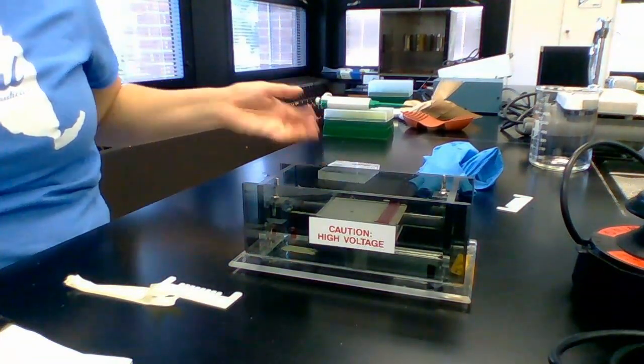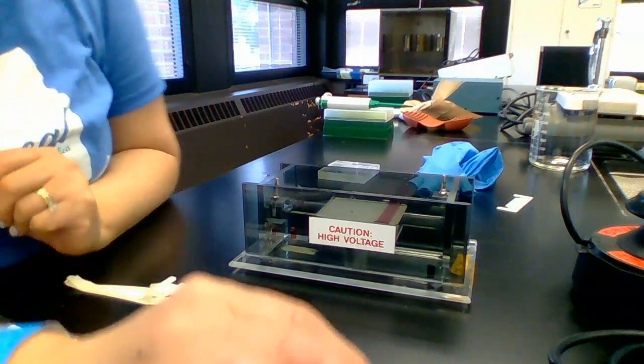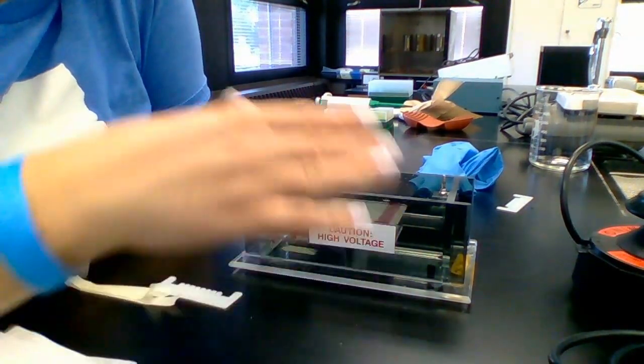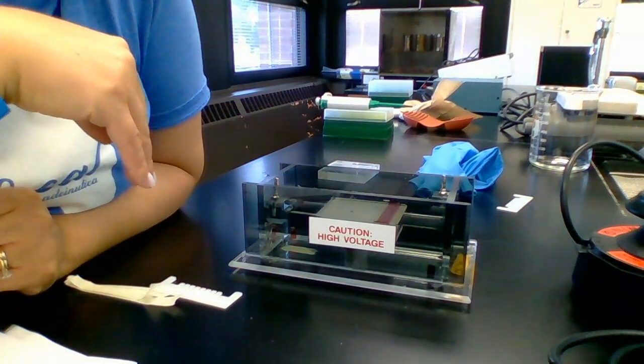I'm going to go ahead and pause the video for just a second. Once our samples are done — about 10 more minutes — I'm going to start recording loading the samples onto the gel.